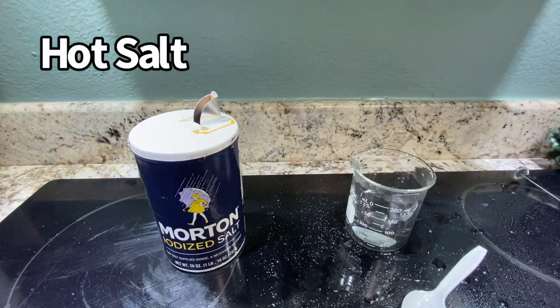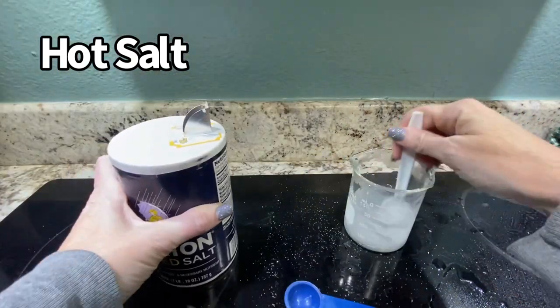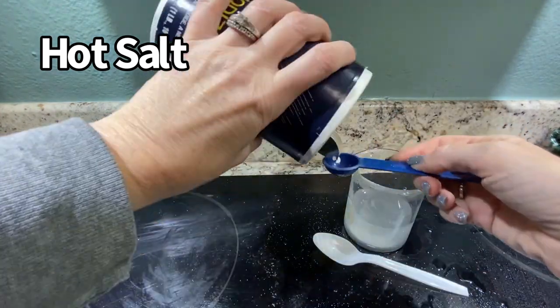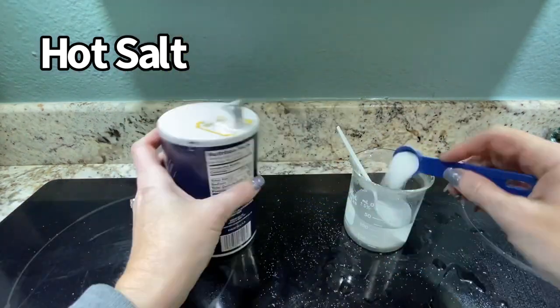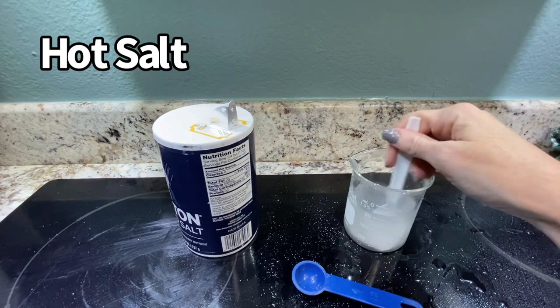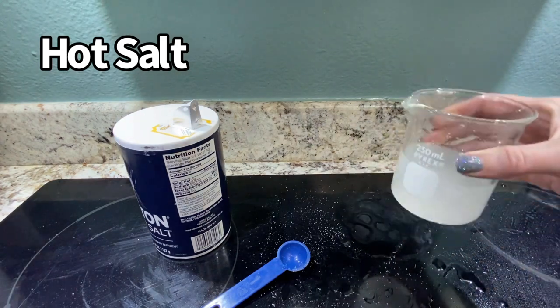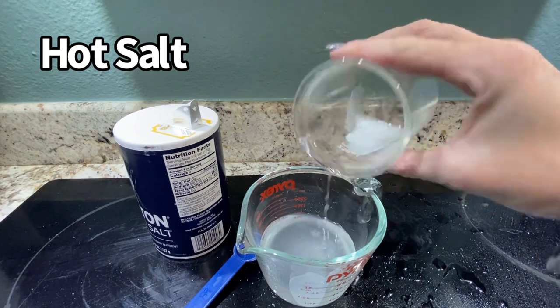123 degrees for our salt. Here we go: 5, 10, 15, 20 — dissolving pretty fast with that warm water — 25, 30, and 35. And we can see when we dump it out, the salt that did not go into solution is stuck at the bottom.